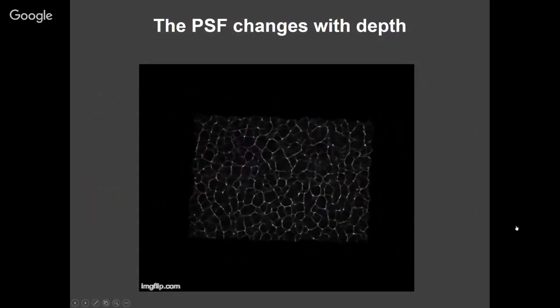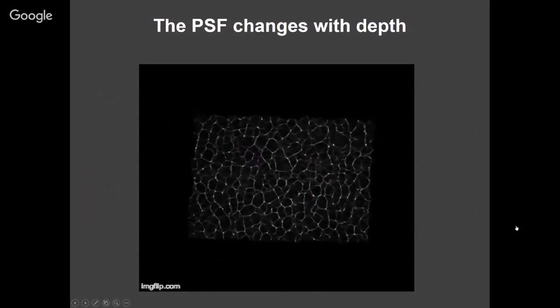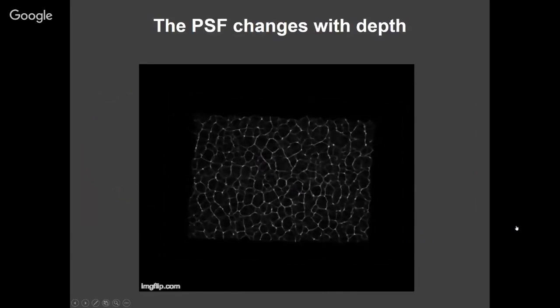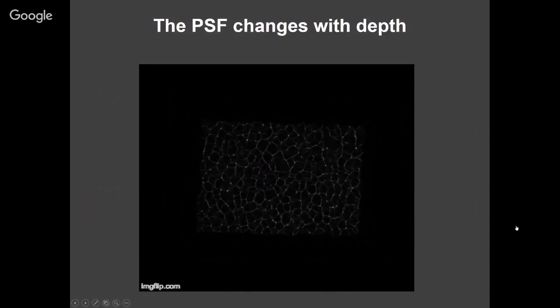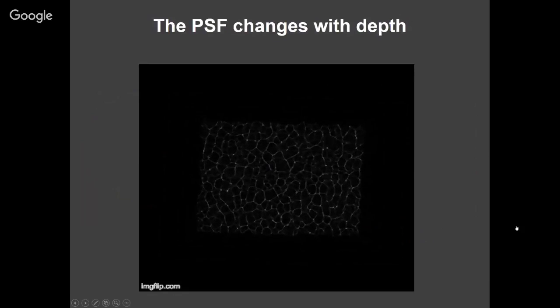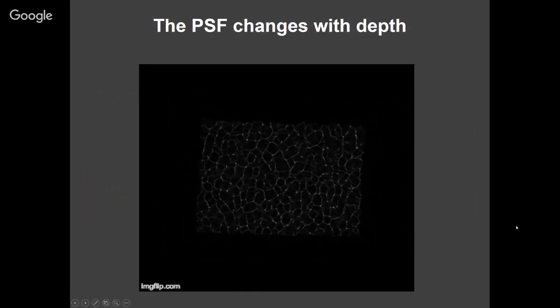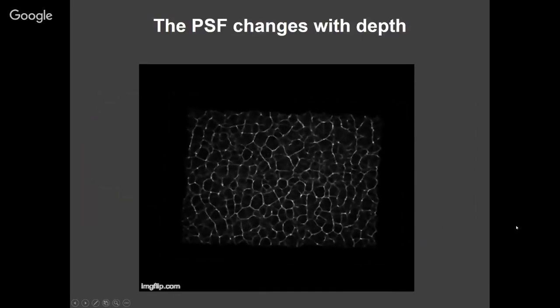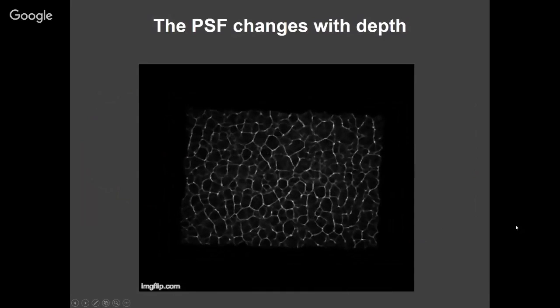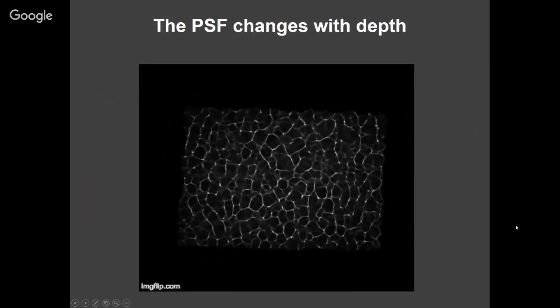Okay, so then we want to do 3D. And so we just take our point source and we move it in depth away from the sensor. The relative distances here are actually relatively small, from a millimeter to a few centimeters away, maybe further than that. And what you see is the point spread function isn't changing very much other than scaling. So it scales with depth and it shifts with lateral motion, right? And this is the model that we're going to use. We call this the convolution model.